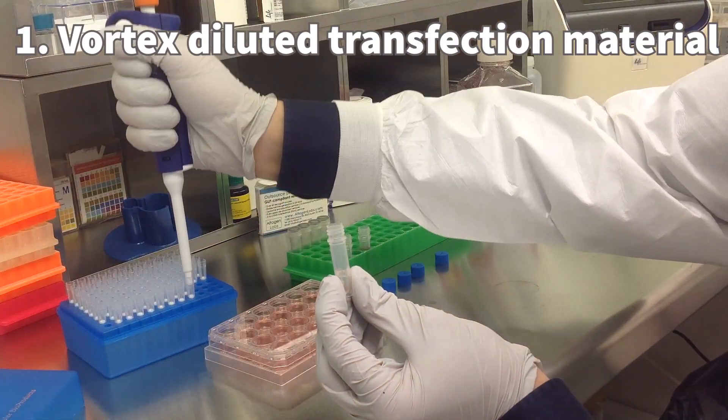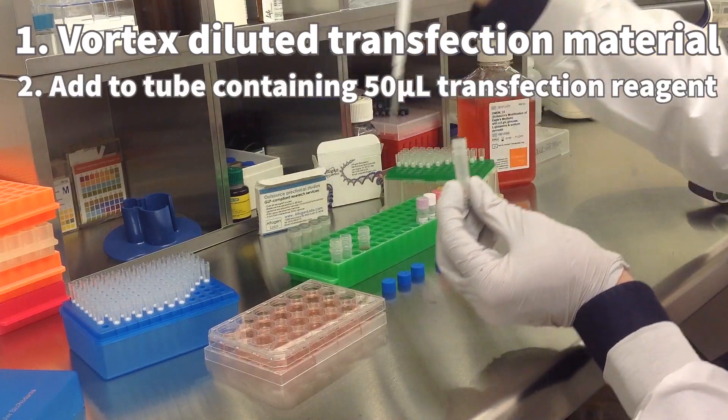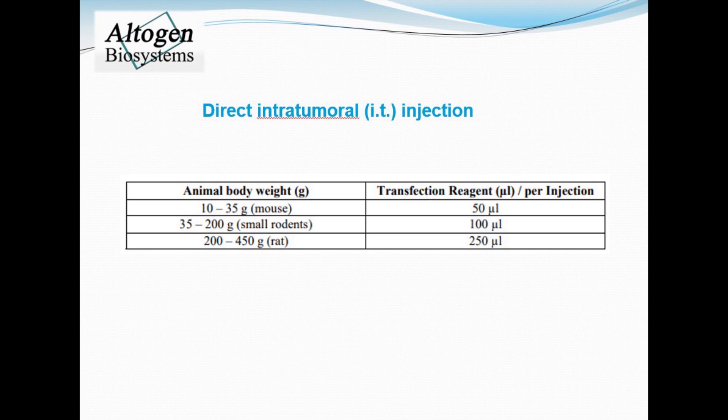Make sure to vortex the diluted transfection material before adding to a sterile tube with transfection reagent. For tail vein IV use 50 microliters of transfection reagent, and for intratumoral administration use the chart to determine the optimal volume.